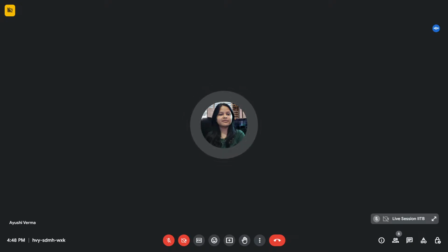You have to keep zooming in. And as you can see, here I'll place the cursor, and you can count how many MS/MS there are in your one MS. So likewise, you'll get how good your data is. As you can see here, we have so many MS/MS. So you can also check the quality of data by checking the MS/MS in your data. And you can also check the intensity from here.